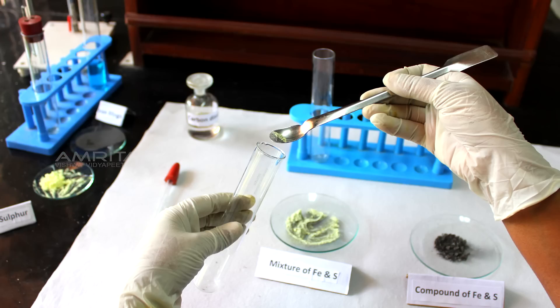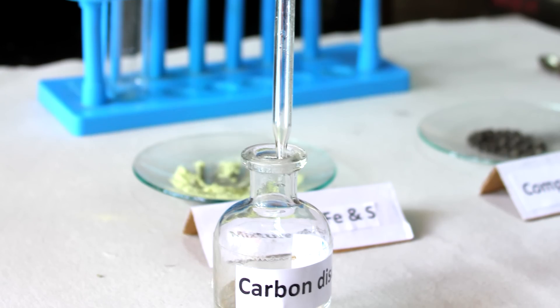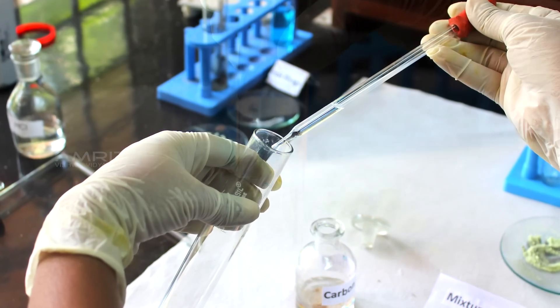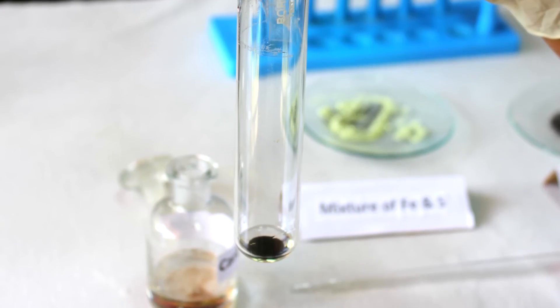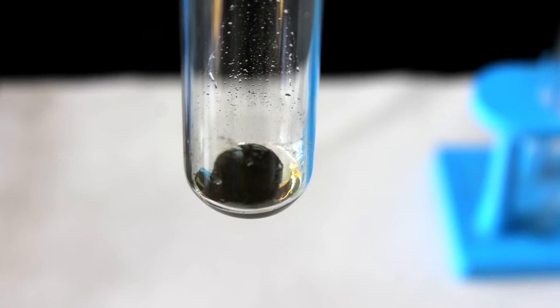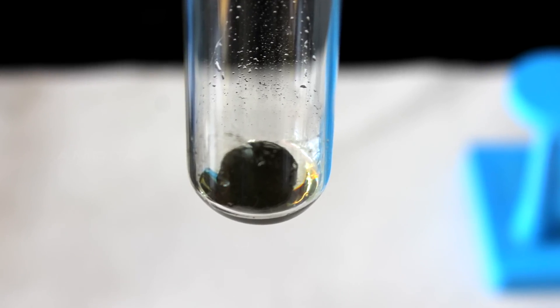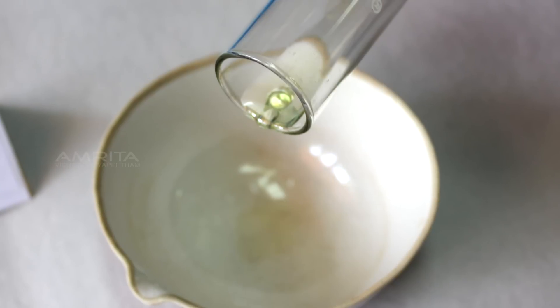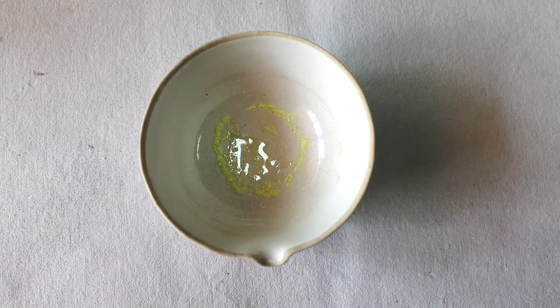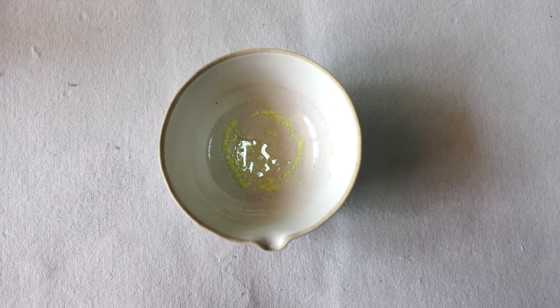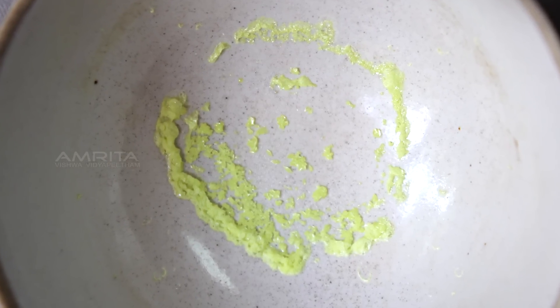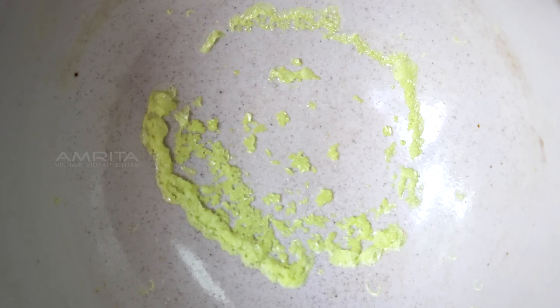Transfer a small quantity of mixture to a clean boiling tube using a spatula and add a few drops of carbon disulphide into this boiling tube. Here, sulphur dissolves in carbon disulphide and forms a yellow coloured solution. Now, decant this yellow coloured solution to the china dish. After some time, we can see that sulphur will reappear as yellow powder and this indicates that sulphur retains its property.